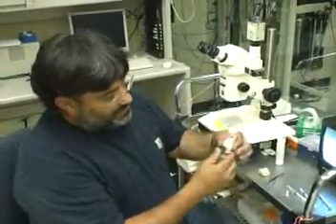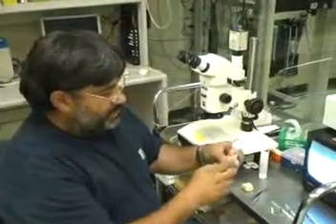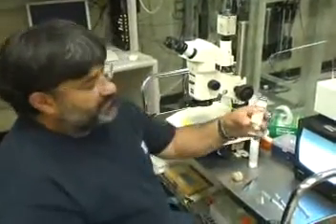I'm going to show Byron how to mount a crystal or something else on a capillary, and to do that we have a couple of instruments in here.